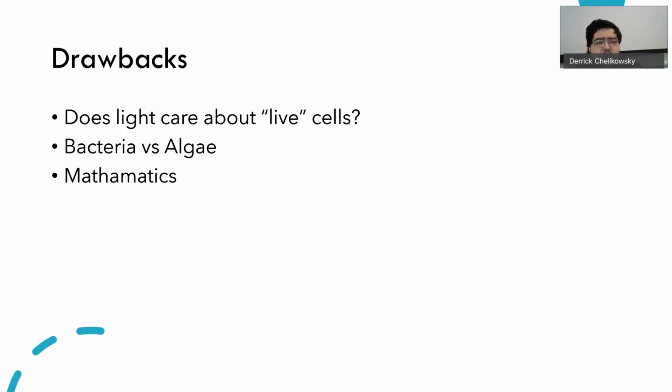So you have to be very careful as to know what your sample actually looks like. If, for instance, you have a culture that starts off at, say, 100% transmittance, drops to 75, goes up to 80, then drops again to 50, most likely you've killed the sample and you're just getting dead cells because it went down, up a little, and then crashed.